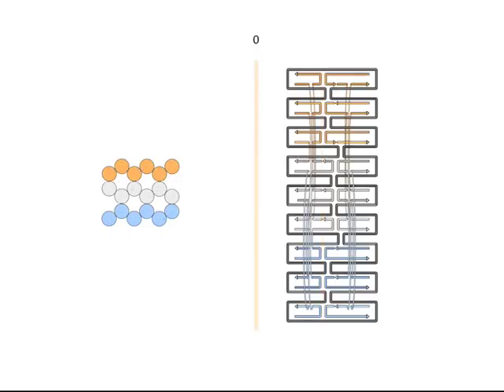To recap, let's step through the entire design seven bases at a time so you can see the crossover positions as they repeat next to each other. So here's position plus 21, 28, 35, 42, 49, and 56.